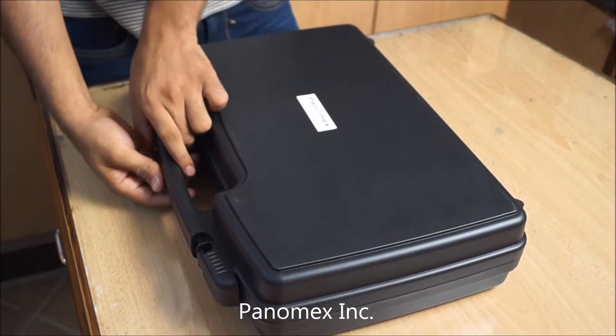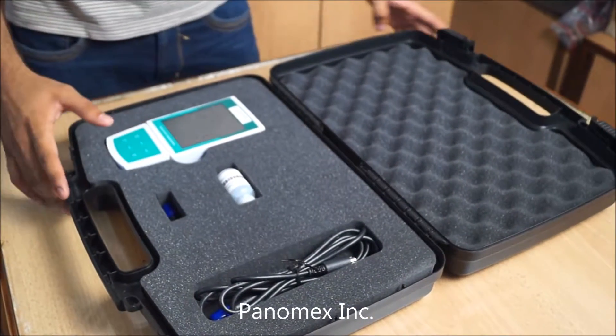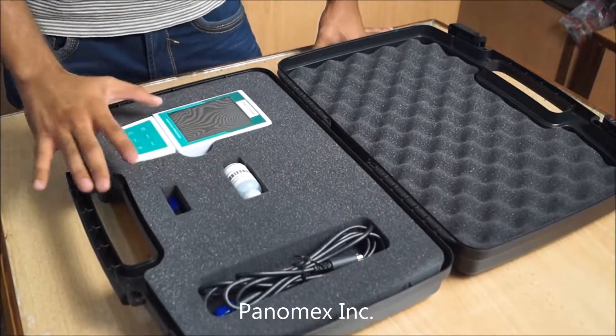The meter comes in this sturdy box. You can easily carry this box anywhere — for field measurement or inside a laboratory.